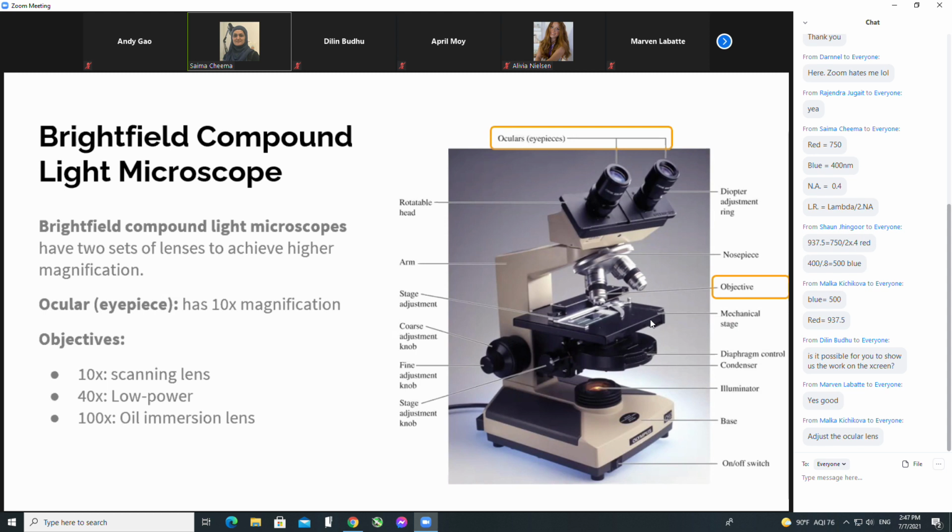And so you want to make sure that once you have oil on the slide, you never swing in the 10x or 40x. At maximum, you can do 4x, because there will be greater working distance between the slide as well as the objective. But as you swing in 10x and especially 40x, the working distance reduces, and so you're going to saturate the 40x objective with oil, and it's not designed to work with oil. Okay, and so if you don't clean it, you forget about it, you're never going to see any image under that objective for the remainder of the class, or for the remainder of the semester.